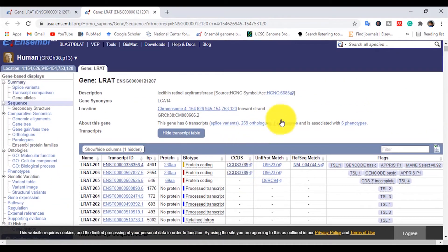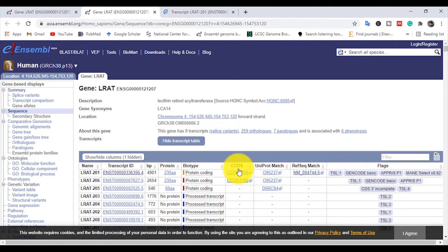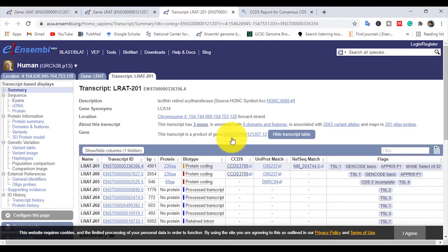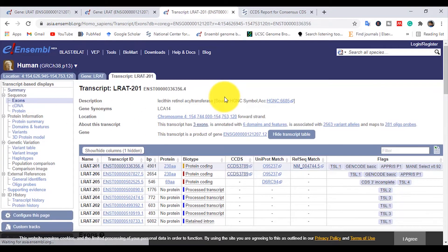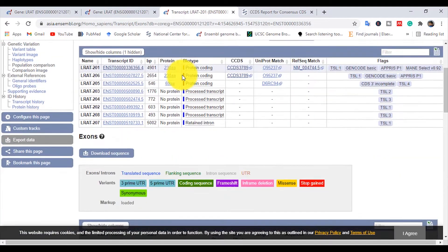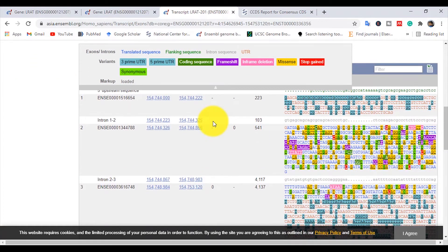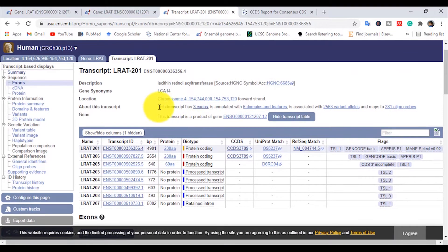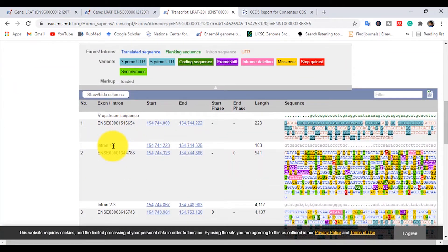Open the transcript ID in a new tab, and also open the CCDS ID in a new tab. In the transcript ID page, click on 'Exon' and you will see the exon regions, as well as the exon and intron layout of the gene. You can see there are three exons in this transcript — exon number one, then an intron, exon number two, then an intron, and exon number three.